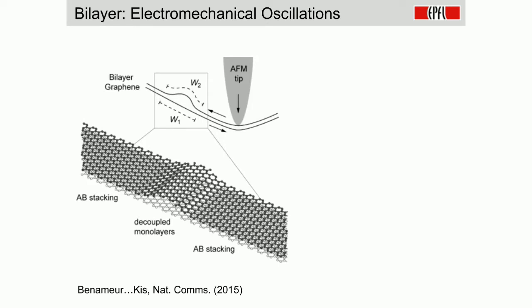And then eventually, in a collaboration with the theory group, we were able to explain this in terms of rippling in a two-layer ribbon. When you have this two-layer ribbon and you apply strain, one of the mechanisms with which strain can relax is the formation of a local ripple or bubble, where the top layer gets decoupled from the bottom, and then as you increase the strain, the size of this decoupled region increases, or maybe their number also increases.